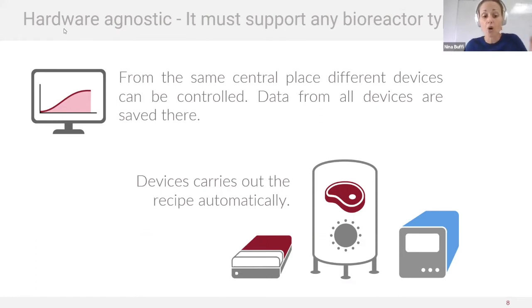Why? Because then all the data, all the instructions, everything is again centralized, and you don't have this nightmare anymore that some data are stored in one device. You need to take them out with a USB stick or somehow get them and put them together with the data from another device. Everything should be just centralized in one place.